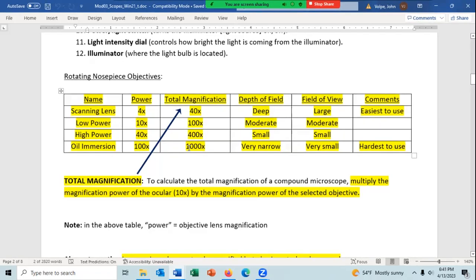And for a child's microscope, you can have something less than 10x, like I've seen 4x for the ocular lens. But all of our lab microscopes, and I think this is true for all of the labs, not just the microbiology lab, at Clark have an ocular lens of 10x. I haven't ever been in most of the other labs, but as far as I know, that's true.